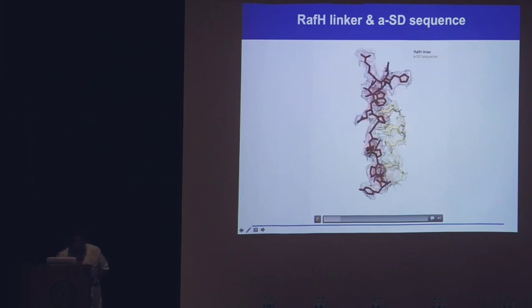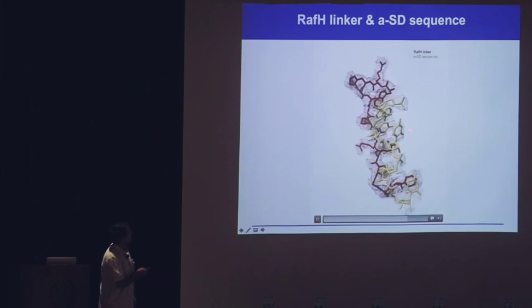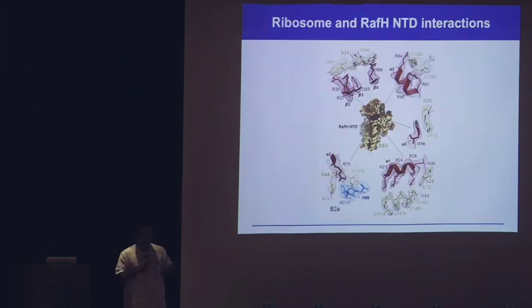Yeah, it's not only 2-dimension, but you can see in all dimensions, every side chain is very much clear. Then if we dissect this NTD and its interaction, how it is interacting here, here, here, here, here, each and every side chain amino acid is very much clear, no ambiguity. So this is the power and the beauty of the cryo-EM. I think this is the right time, a golden opportunity. Students here, they should grab this opportunity. That's what I can say.